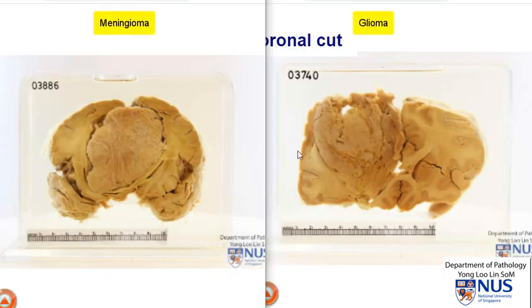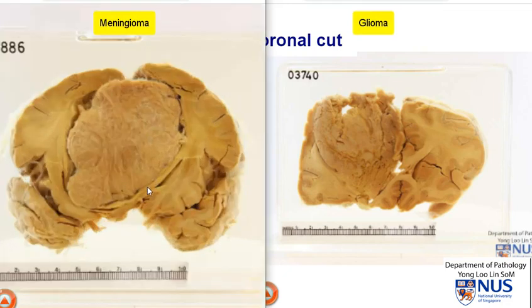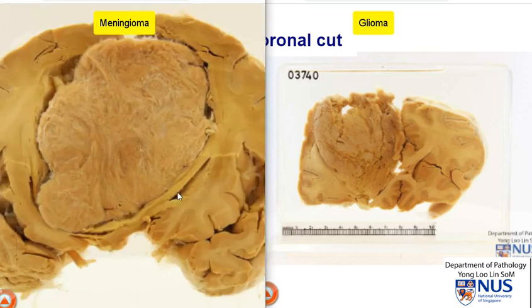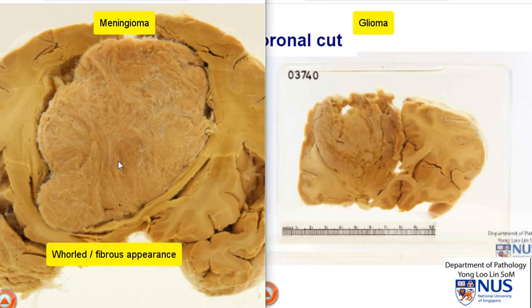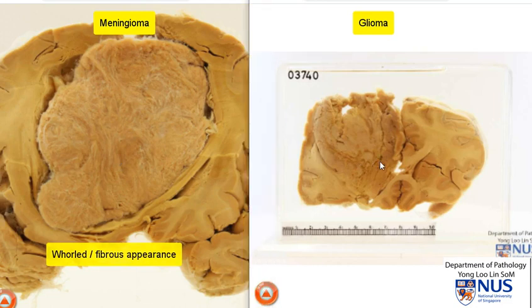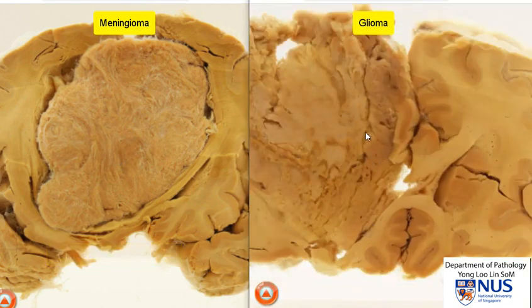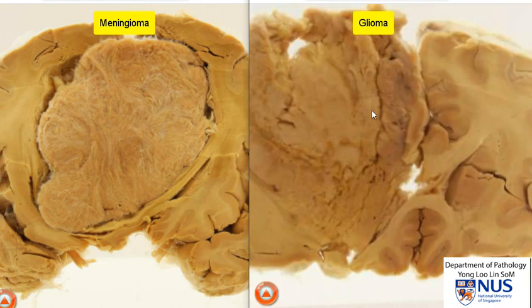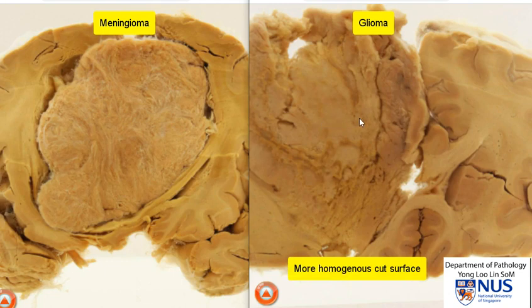Here we have a side-by-side comparison showing an example of a meningioma. You can see that it's very much more sharply demarcated from the rest of the brain and also it has a different appearance on the cut surface. It is somewhat browner and it's got these pale areas with almost a whorled appearance or texture on the cut surface, as opposed to this glial tumour, which is much more ill-defined and has a more homogeneous cut surface.